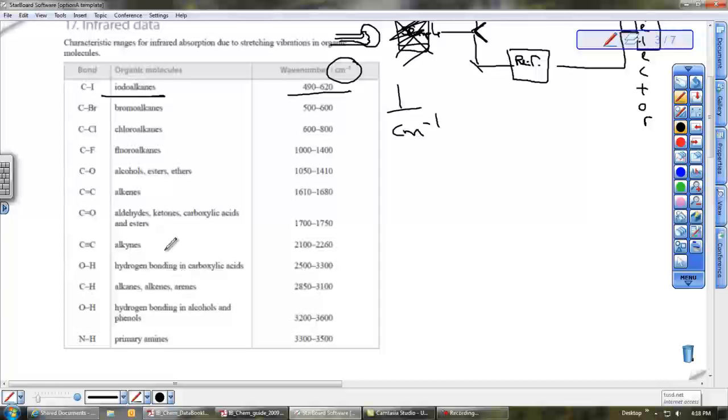So, for example, common ones are these hydroxide groups, or hydroxyl groups. They are present in alcohols, phenols, which is not important what that is, but what you'll see is a definite signal in that range if there is an alcohol group present. If there is no OH group as part of alcohols or phenols, you won't see a peak in that sequence. Here's hydroxyls and carboxylic acid. Again, a definite peak there.